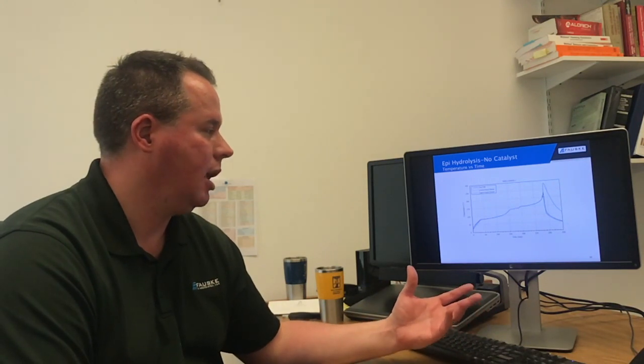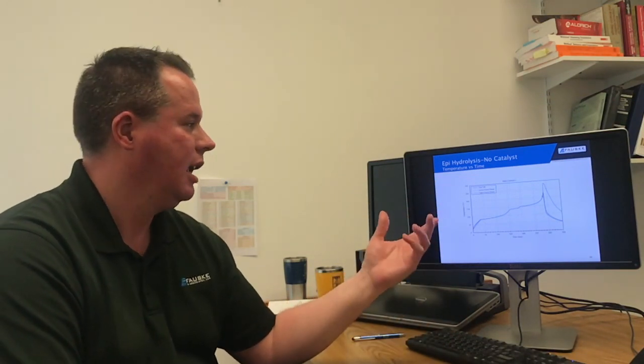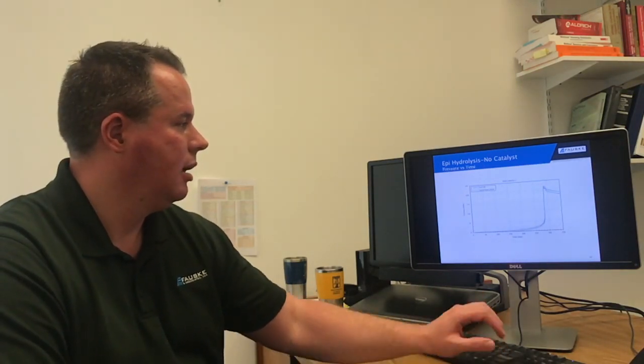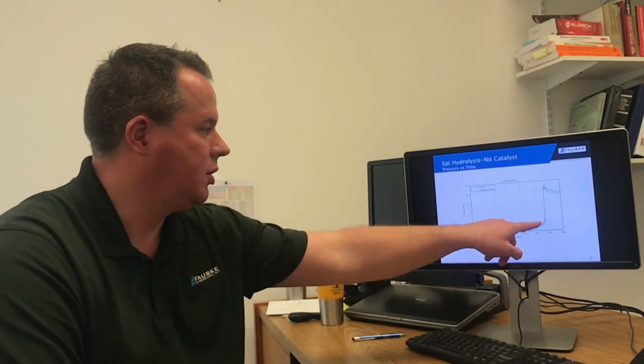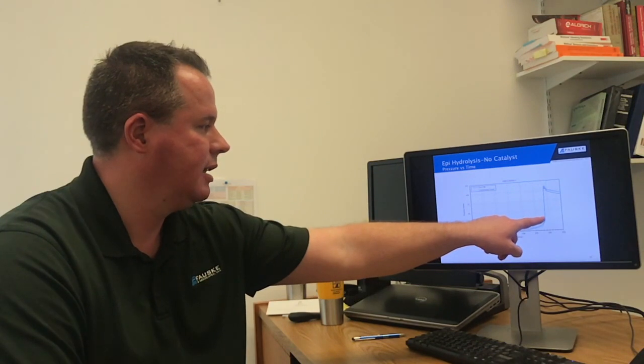But this reaction is so exothermic that even without the heaters keeping it adiabatic, it continued to react, and the temperature and the pressure continued to increase. You can see the pressure was about here when I shut off the test, and yet it still managed to jump up pretty quickly to about 113 bar. So definitely very, very exciting.